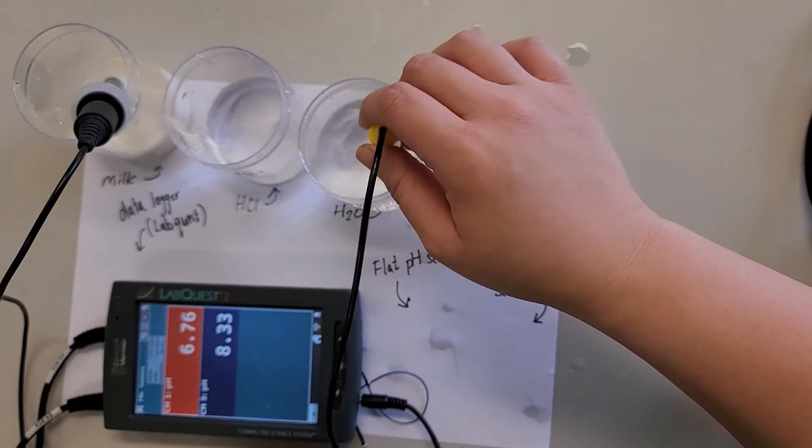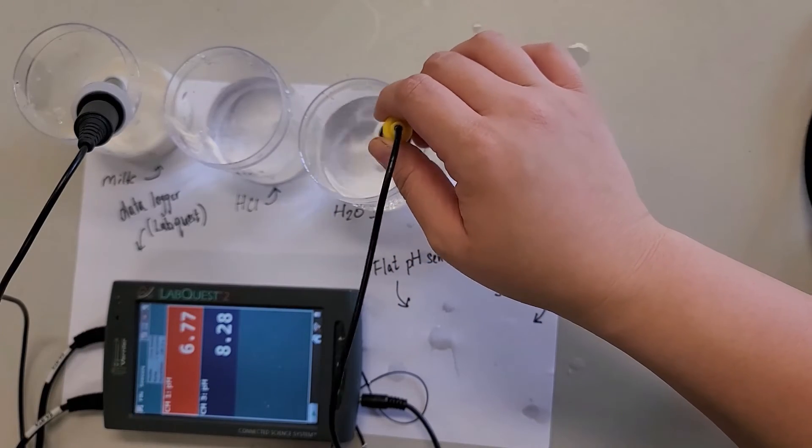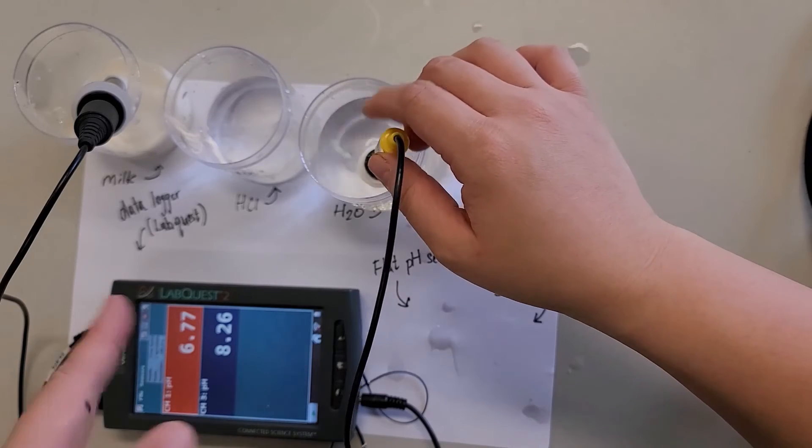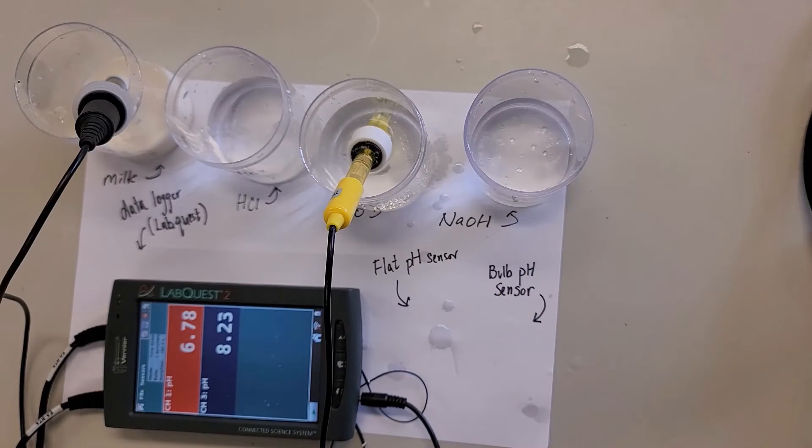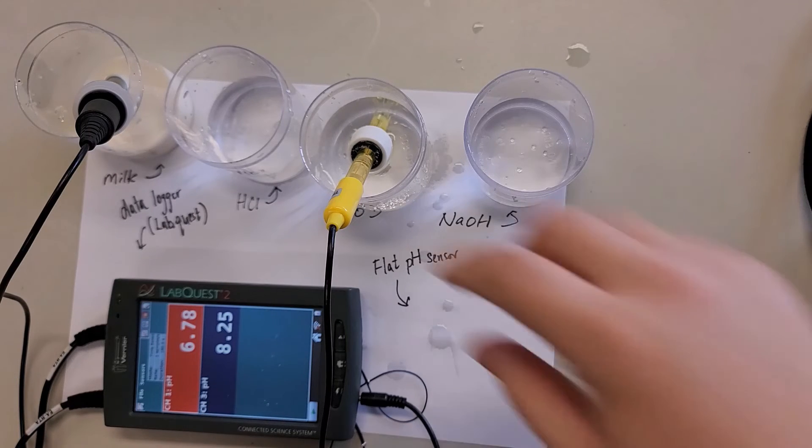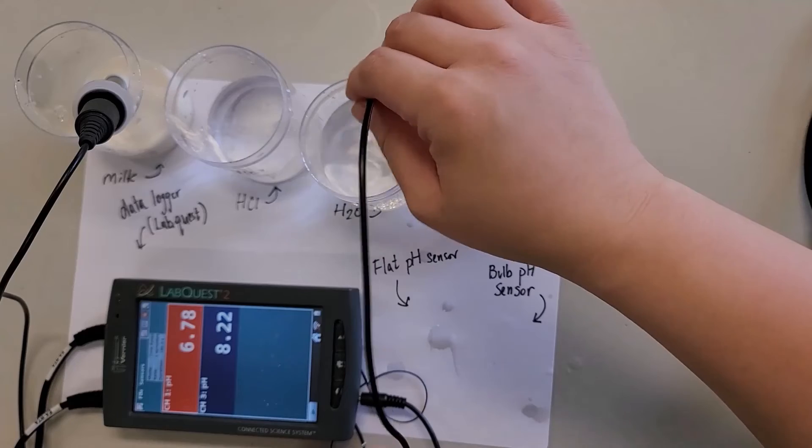Actually, the milk is a bit stable now, so it's 6.7 something. It's okay, because actually it's oat milk already. It might have turned sour already. So yeah, so this one is like, it's dropping. Still dropping. So there's the pH of water.